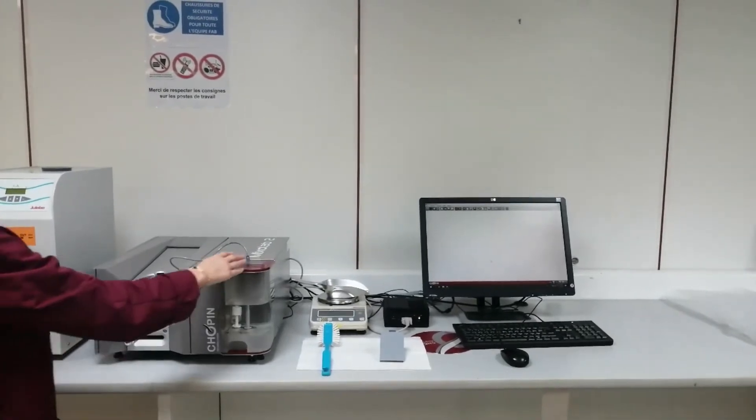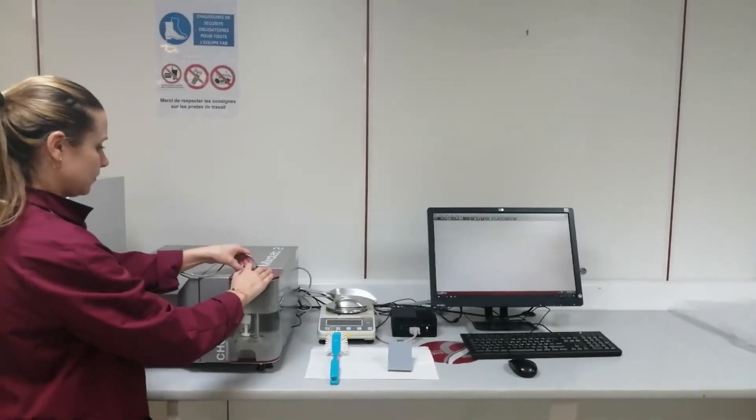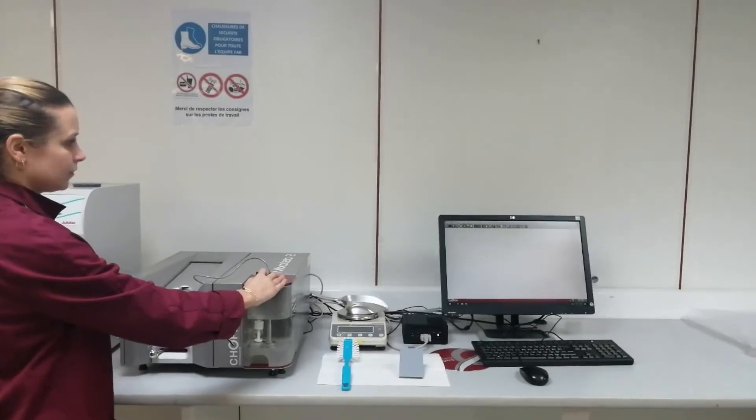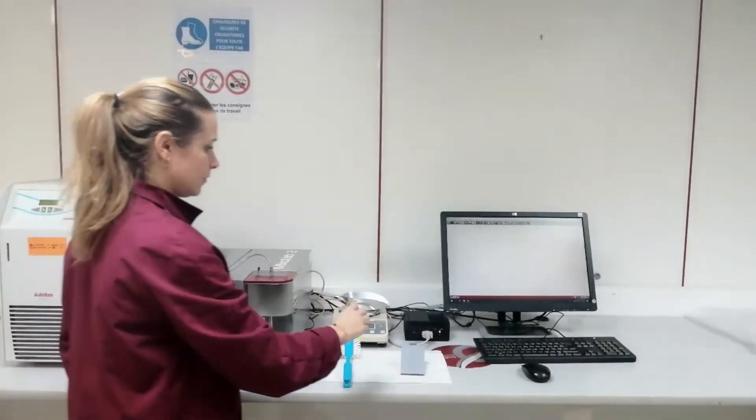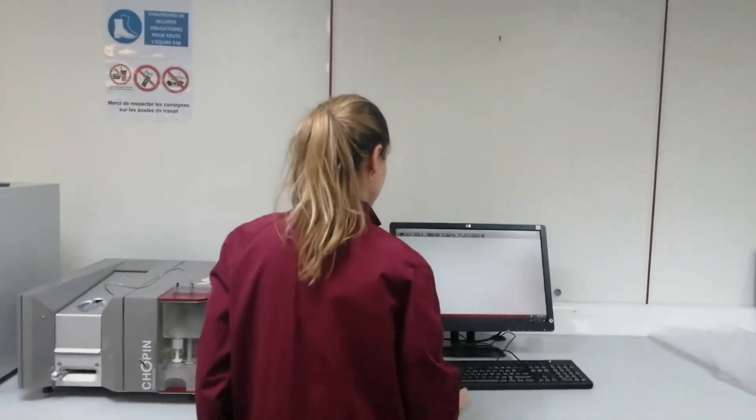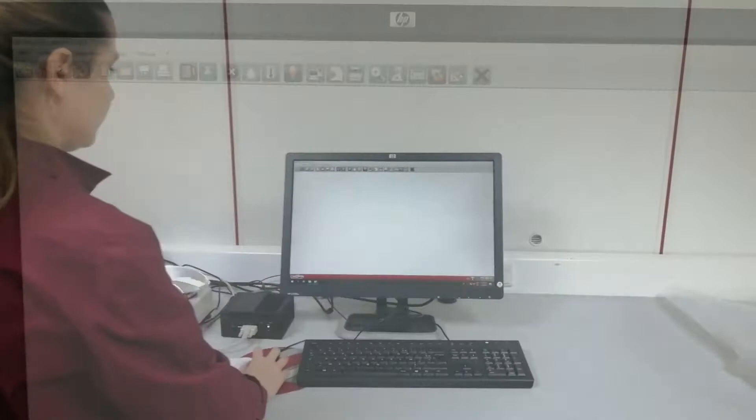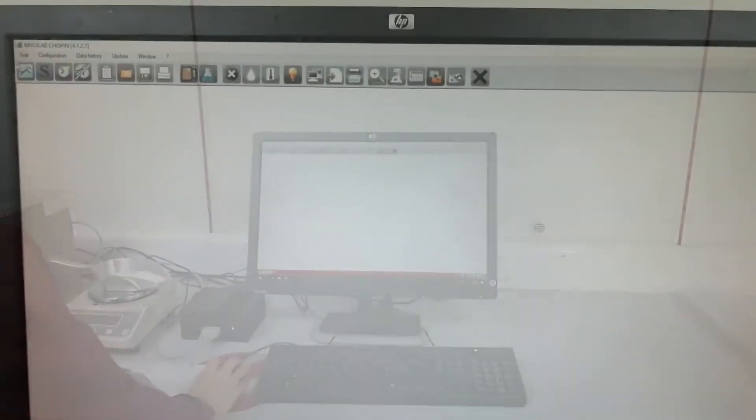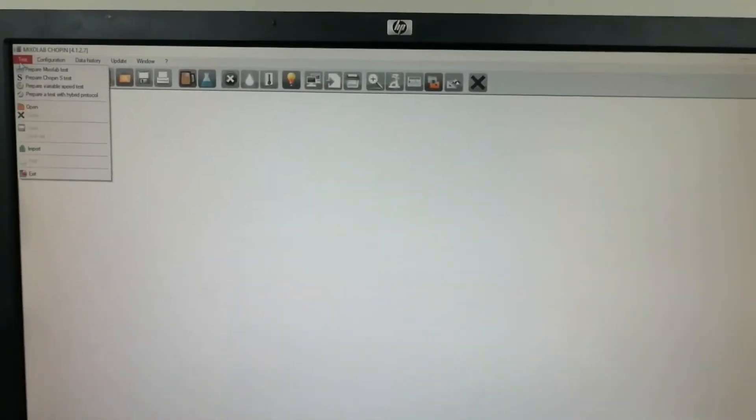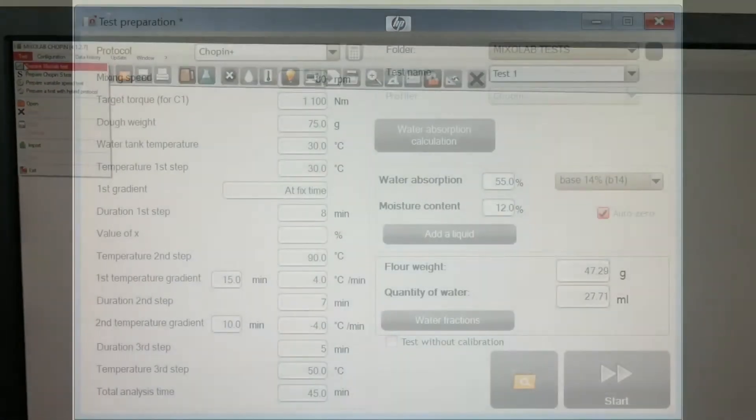Before starting a test, ensure that the nozzle is positioned on the tank. In order to run a test, you need first to configure the test within the software. Click on Test, then Prepare a Mixolab test.